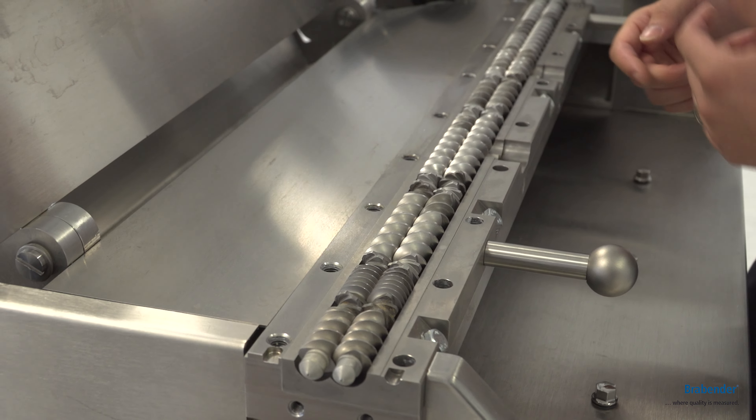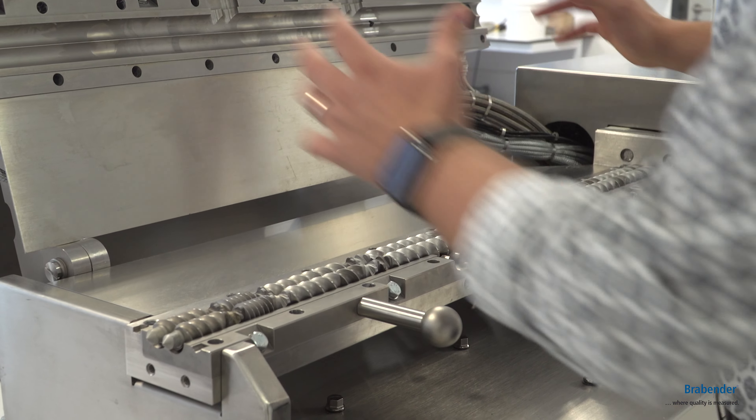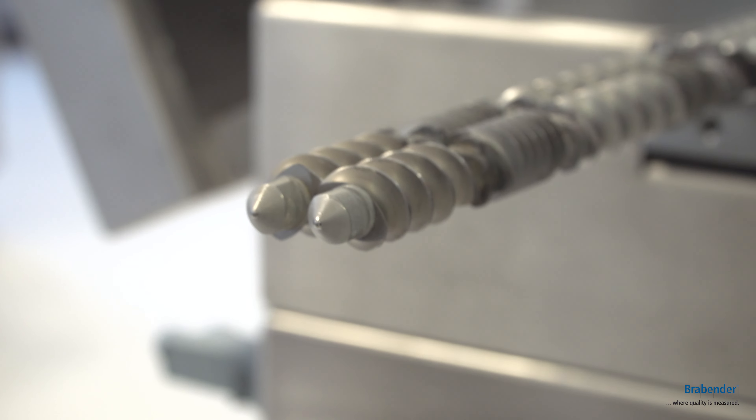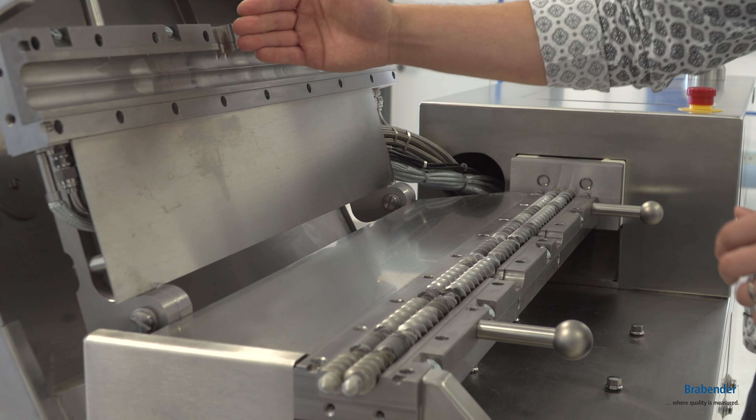Another big advantage is of course the very easy cleaning process, because you just open the liner system, bring out the screws very easily, and then you can clean the screws as well as the liner.